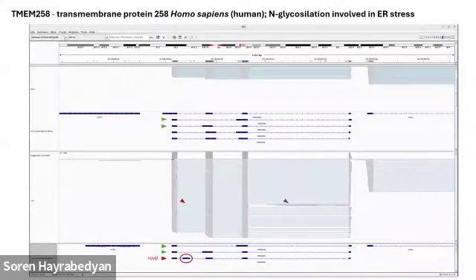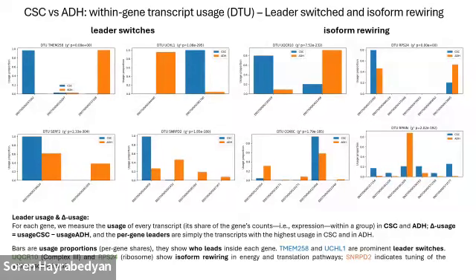These 2 transcripts are retained in the cancerous phenotype, but there is a novel one with an intron inside, and there is one point that is probably a cryptic exon, because it is in the intron part. It shouldn't be there. And you see multiple reads that confirm that. And this is not deep sequencing. This is a small, low-depth cell run. So usually deep sequencing gives better results.